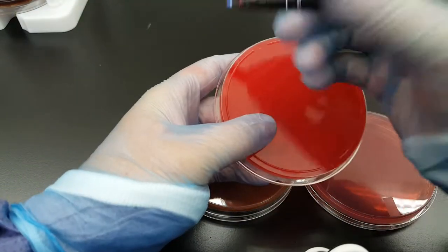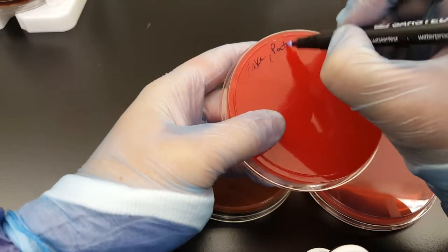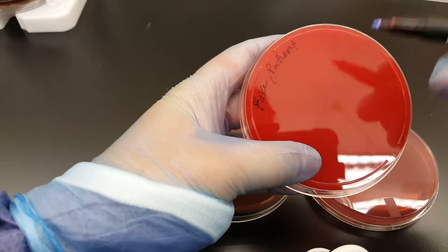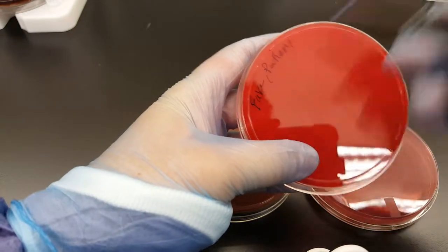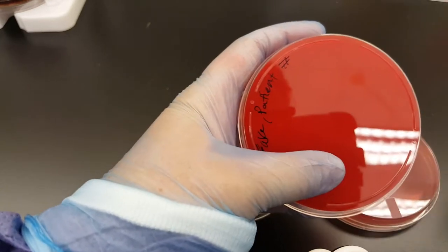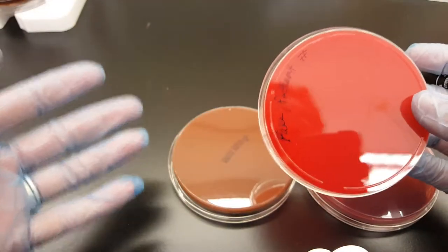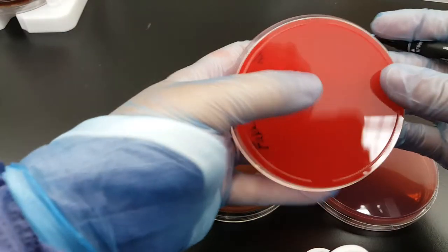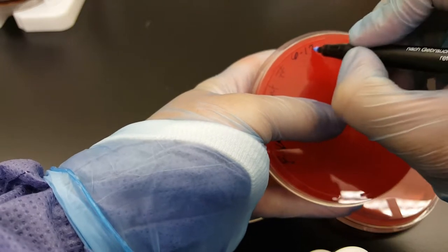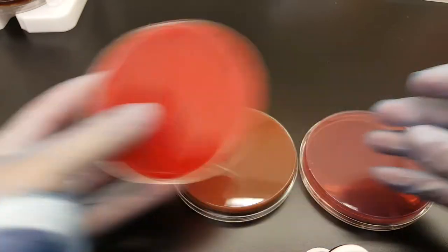So the first thing we're going to do is label my plates. This is a fake patient. We'll write the last and first name of the patient, and then the patient's medical record number. In class, you don't necessarily need to do this unless I say it's unknown one or unknown two. Then you're going to do the date and your initials, and you would do that for all of the plates.